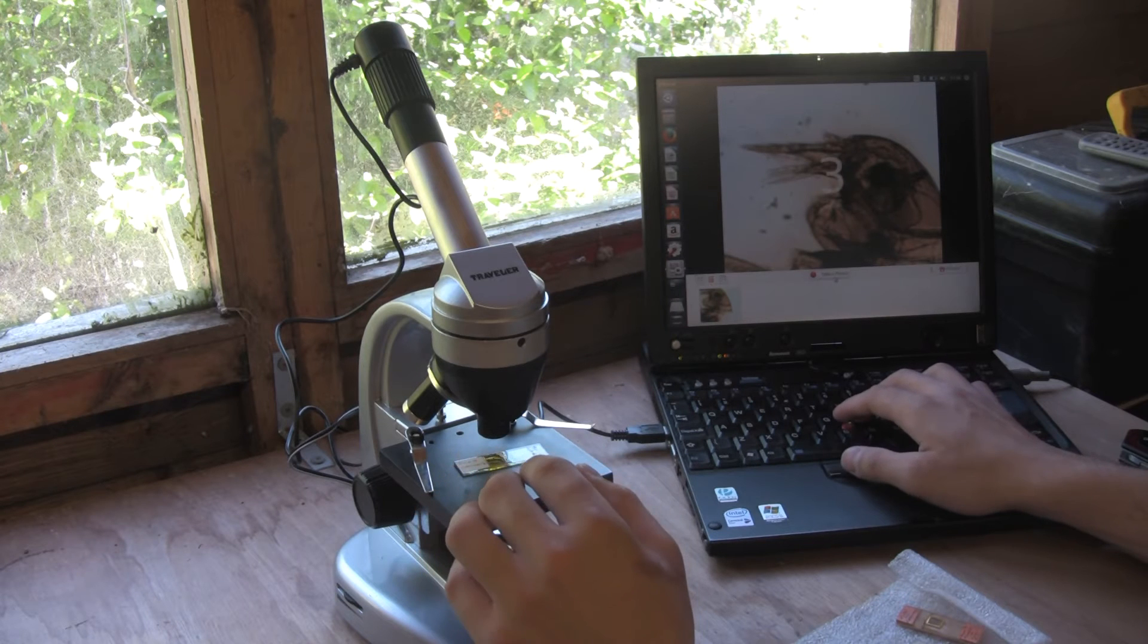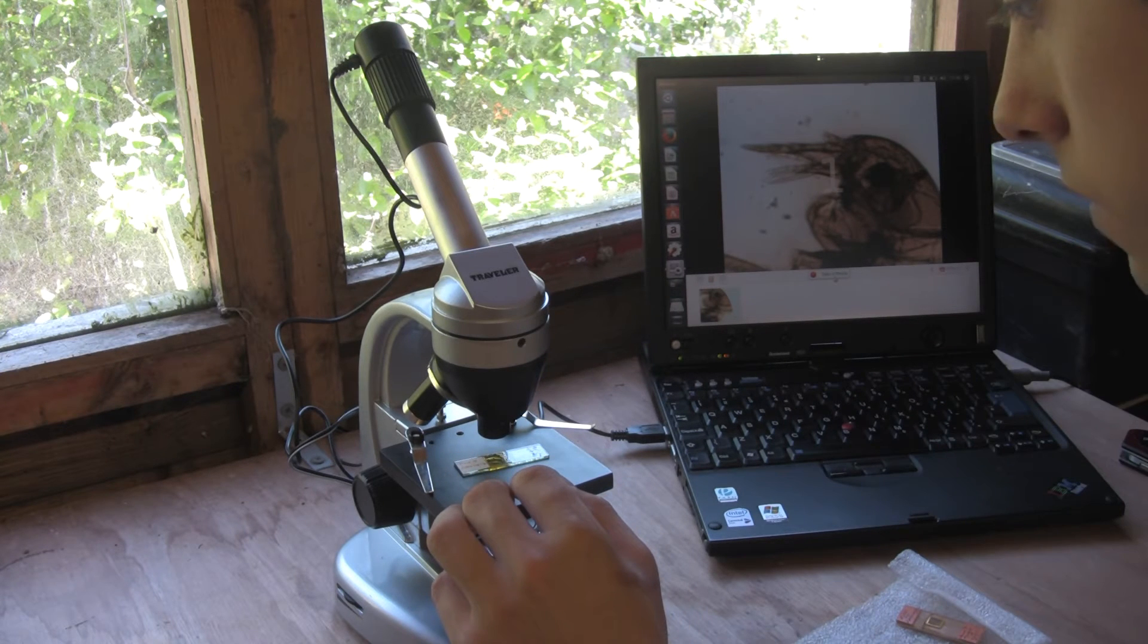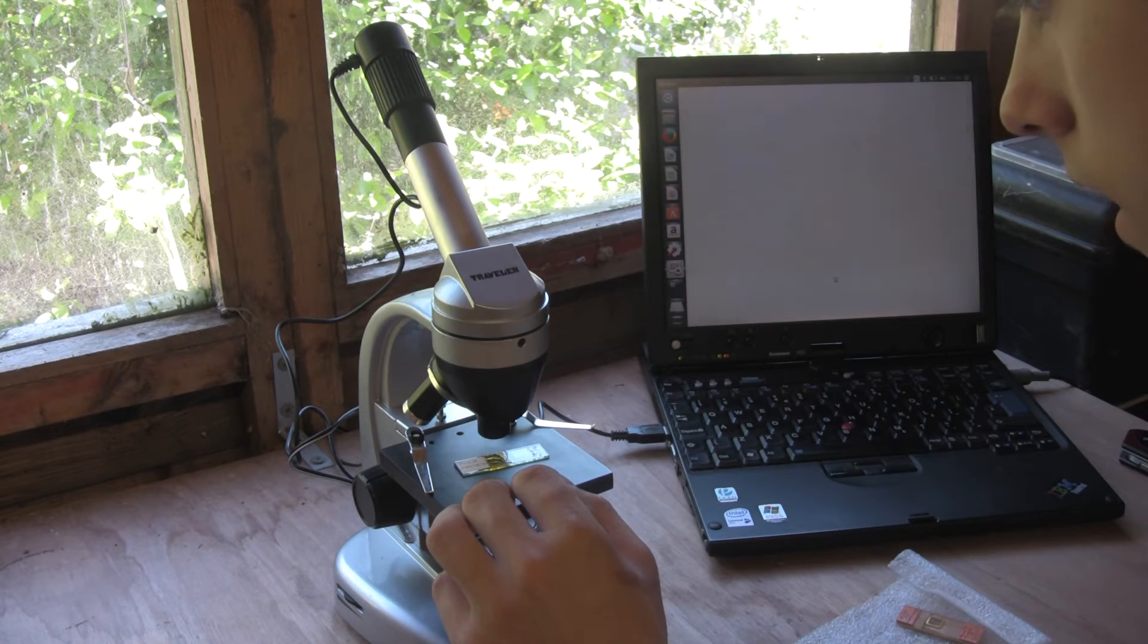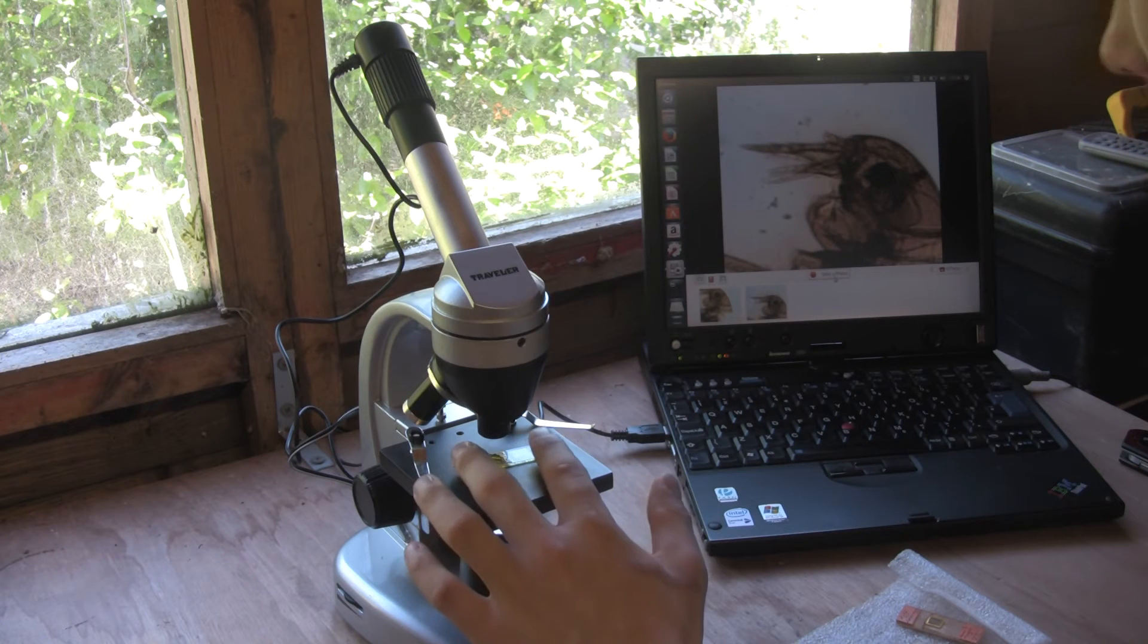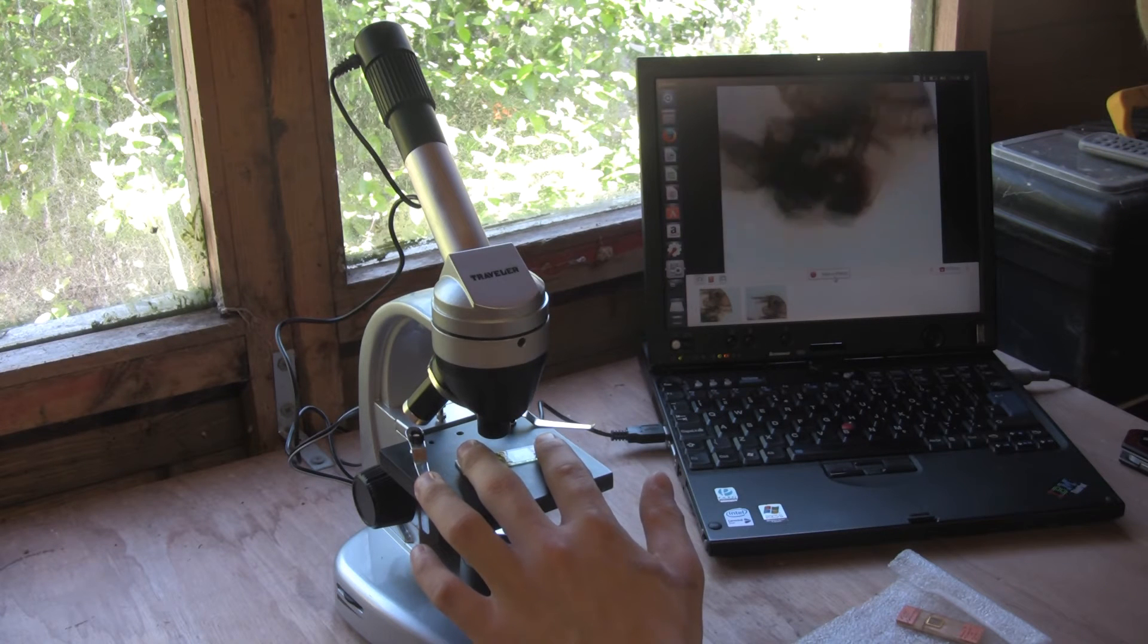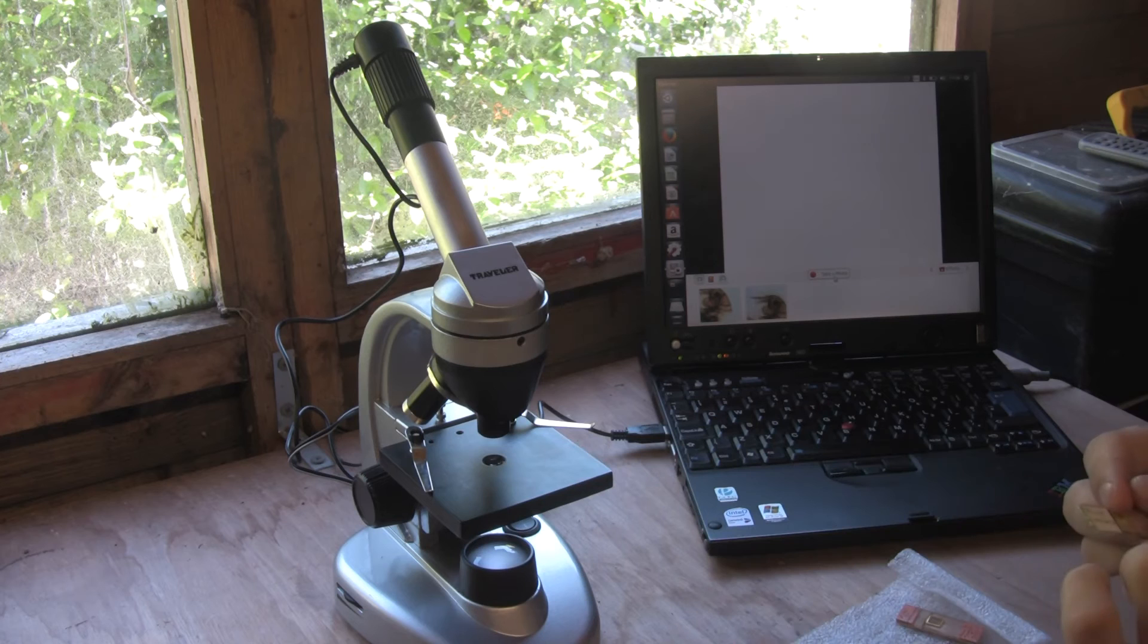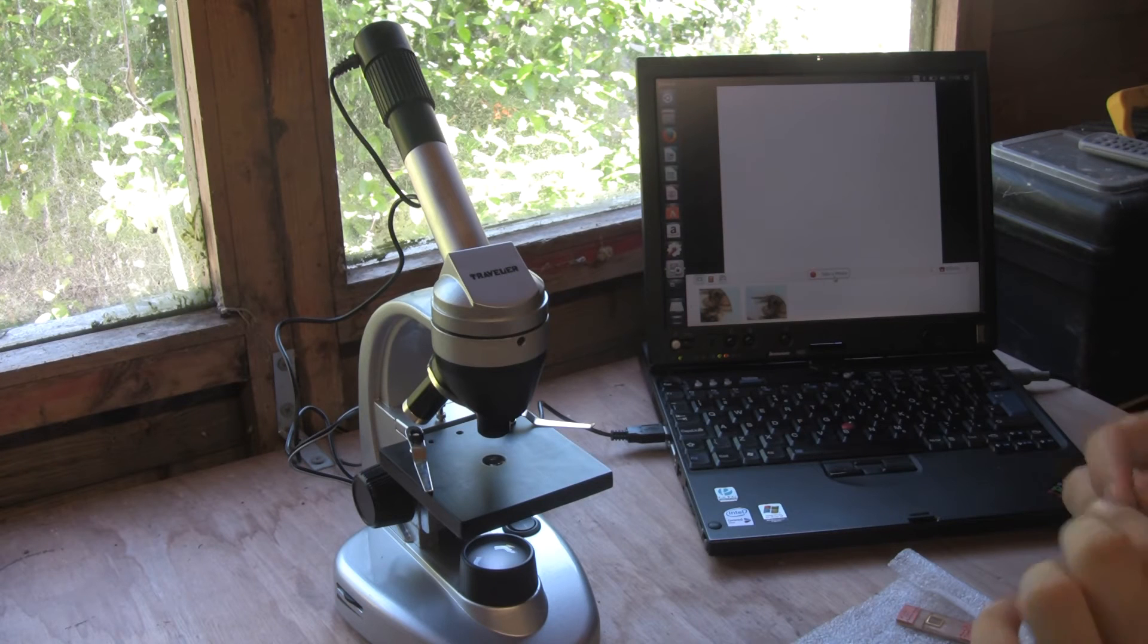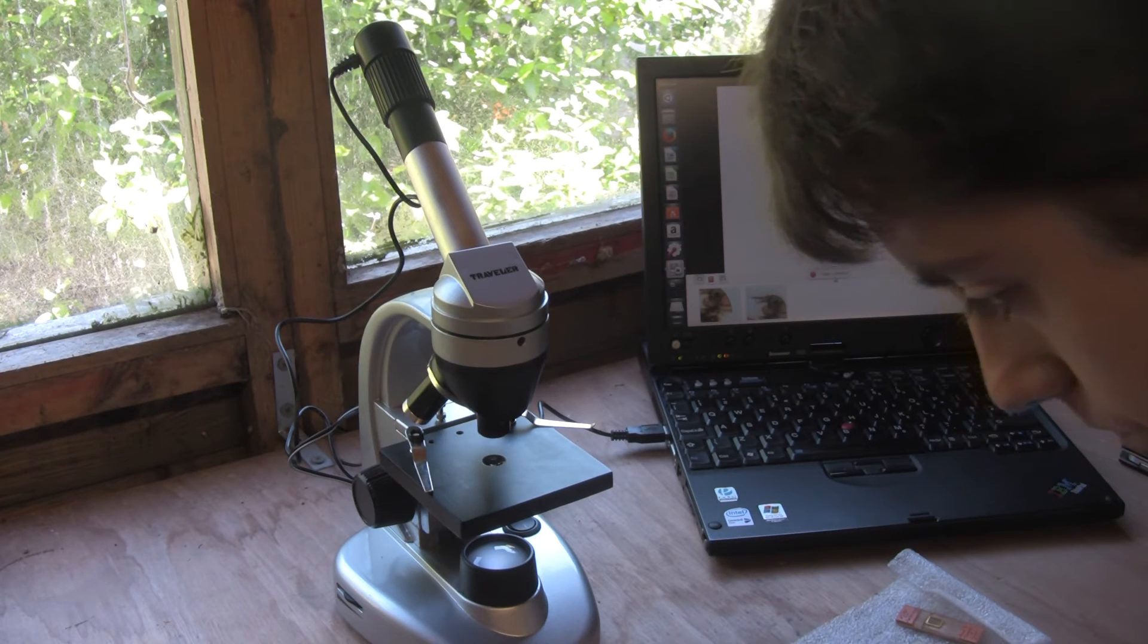So this is a flea lancet, whatever that means. L-A-N-C-E-T-S. Some of this old writing is really tricky to read.